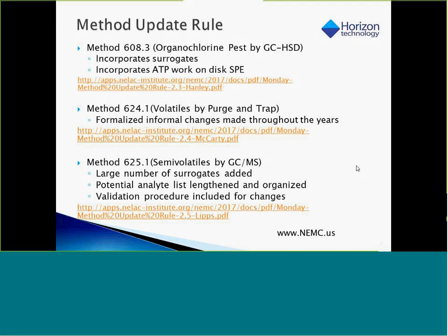Now you'll see a link here on these slides, and that's a link to a talk at NEMC, the National Environmental Monitoring Conference. There's an excellent session at this conference held in the first week of August that talked about some of the changes to the methods. So I refer you to the link to the slides that were given by Adrian Hanley for Method 608 to get more detailed information on what has changed.